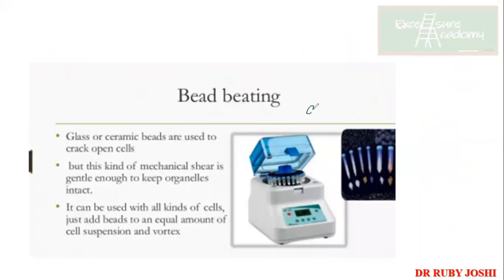Where you have got glass beads, okay? Glass beads, sorry. Now how is it with glass beads? In these glass beads, you are going to add your culture. So they will come in here like this. Because of the centrifugation and agitation, in between the beads the cells are going to get lysed. Okay, so this is your bead beating.